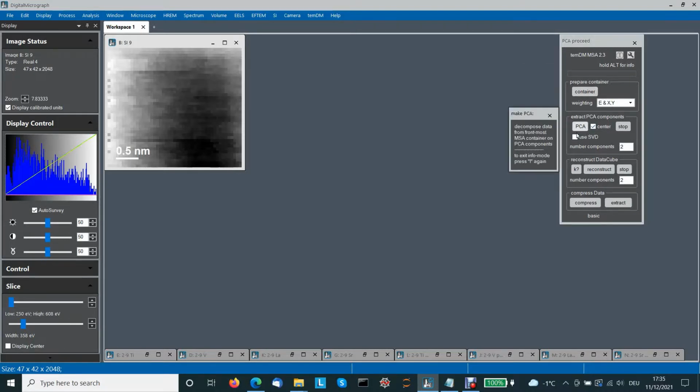Okay, the next button is PCA, just to extract as many principal components from the data as you want. Good. And finally, reconstruct. It means to reconstruct data with the number of principal components you want. Good. Now let's exit the information mode, and now clicking each button would really induce some action.